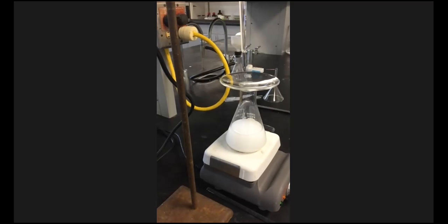If I add calcium chloride and calcium chloride is already in excess, then you're not going to see any precipitate because there's plenty of calcium chloride left. So the limiting reactant is present in the smallest amount. When it's used up, the reaction is over. And the other reactant by default is the excess reactant. So it doesn't matter how much more excess you add, if there's no more limiting reactant to react with it, it doesn't change anything. All right, did that make sense to all of you who are listening in?